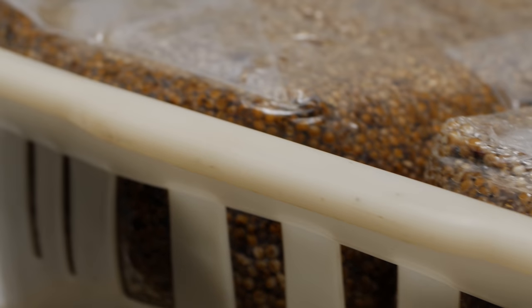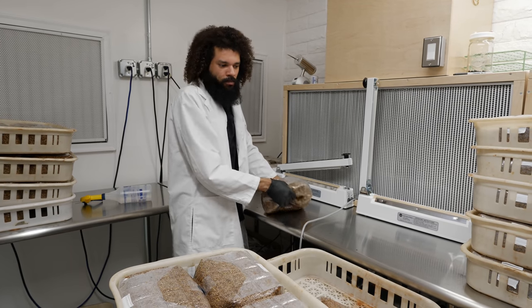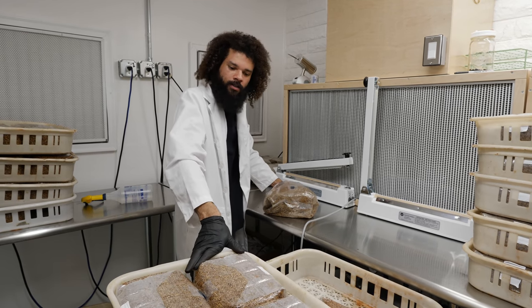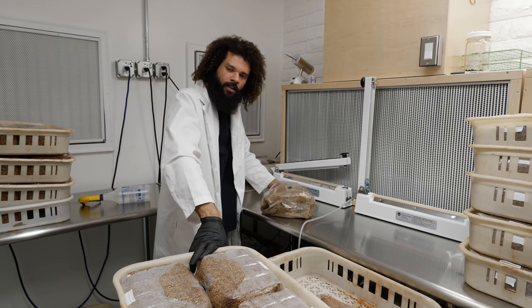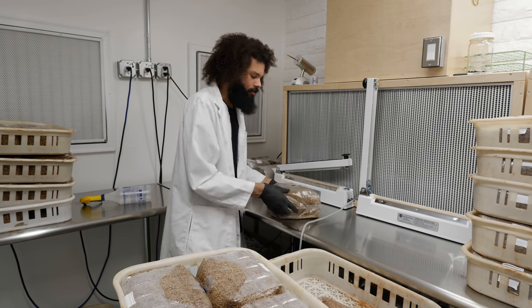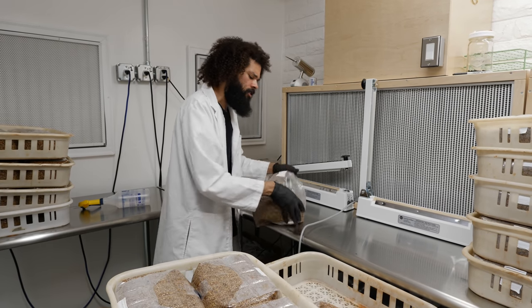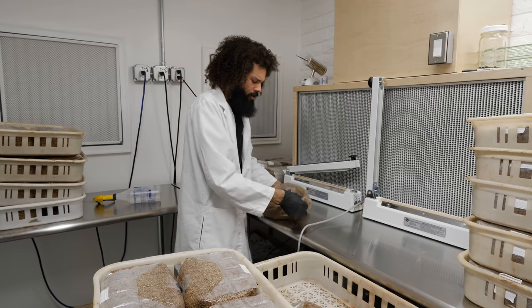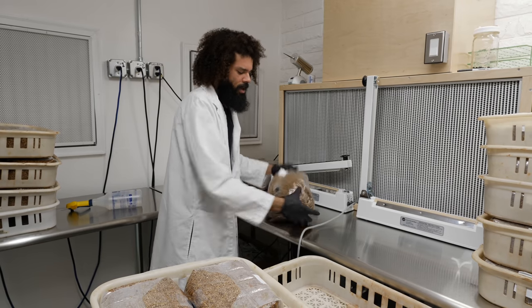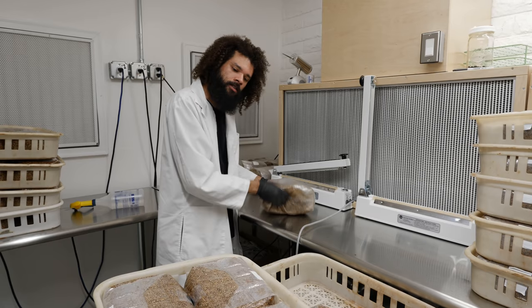The baskets make it easy to load and unload the autoclave — they're built to withstand the high temperatures inside. I've been using them through many sterilization cycles and they definitely come in handy. Without them, the autoclave is pretty rough inside — it's a heavy-duty machine with heavy metal, and if you set the bags directly in there it just wouldn't be as efficient as stacking them on trays and sliding them onto the rack.